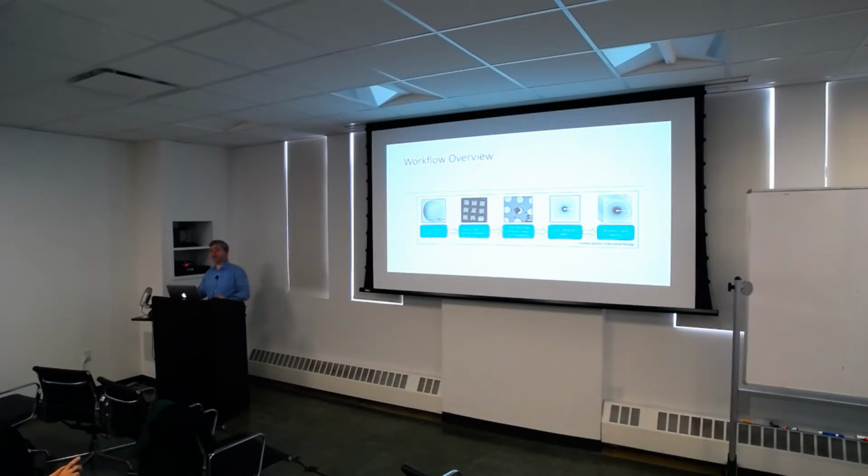Oh, 8, okay. Yeah, that's the limit he has said. In principle, planar geometry should be okay, right? Because 2D crystallography also works. But 2D crystallography is different from this 3D method, where you're tilting it so that you get the other dimension. If it's too thin in that direction, it's just blurred out. So if 8 is the limit, 8 would still be pretty thin.